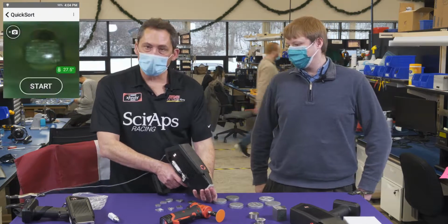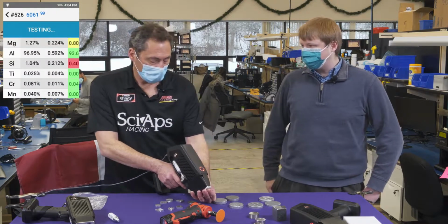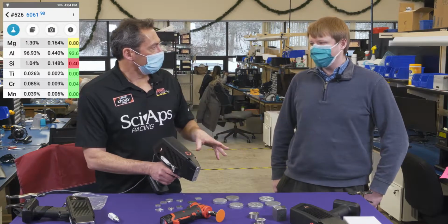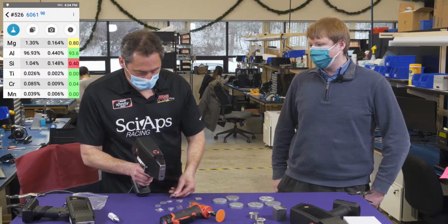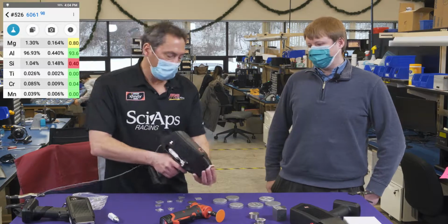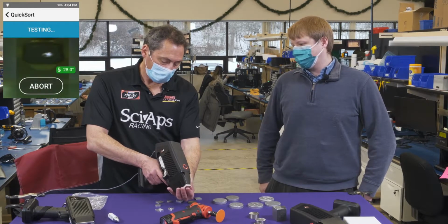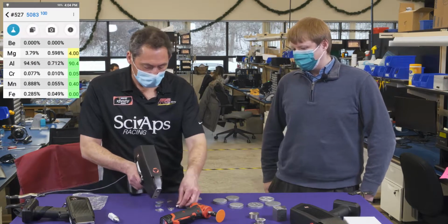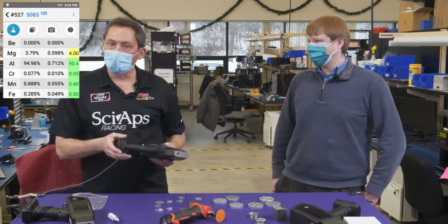And you see we're not grinding or doing any sample prep on these things, right? That's right, it's still doing the laser cleaning. So it still uses the lasers to burn off some of the dirt and all. Yeah, oxide layers, corrosion. That's good. And what else can we shoot? We already shot that. Here's a high magnesium 5000. So it just identifies everything, gives you pretty good chemistry, actually quite good chemistry even though it's in air. This unit's been redesigned to have a lot more signal.